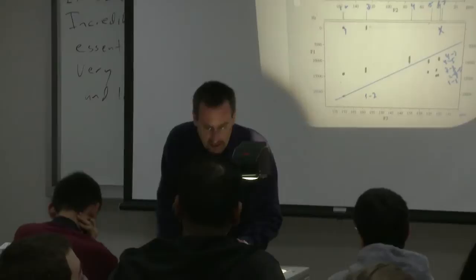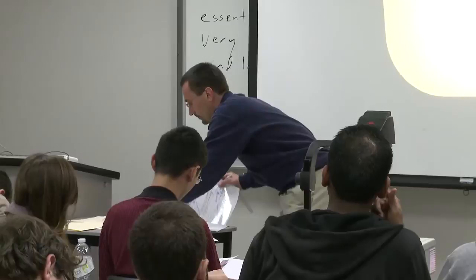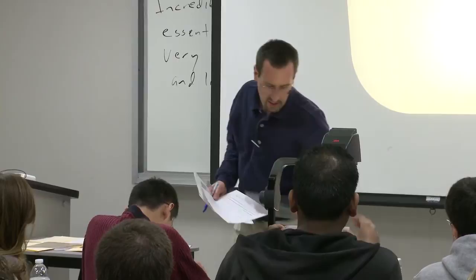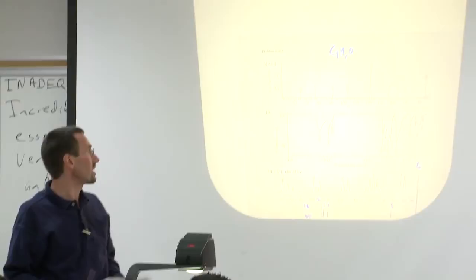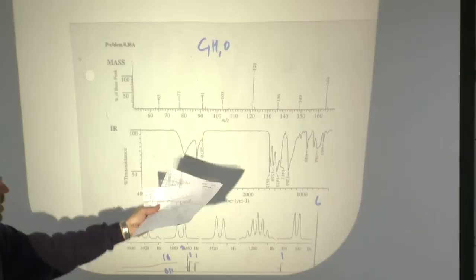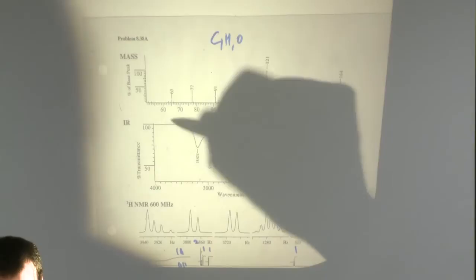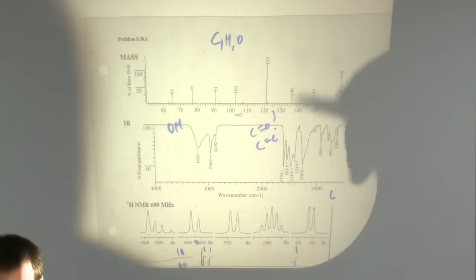All right, I think this and the IR spectrum are going to be enough. You can do a little bit with the COSY on it. Take a look at the IR spectrum. There's obviously some stuff going on. This molecule has carbon, hydrogen, oxygen. We obviously have some type of alcohol. We've got some stuff going on here that's interesting, either with carbonyls or double bonds or something. Something that's pretty obviously an OH, but then something interesting. You'll figure it out at this point. All right, I think that's all I want to do on that problem to help you get started.